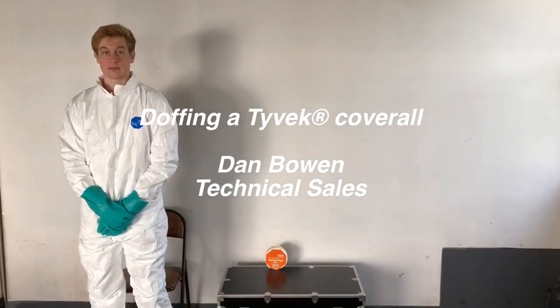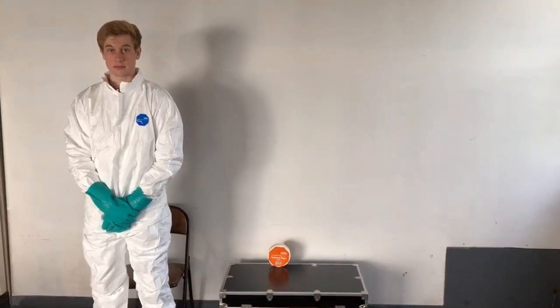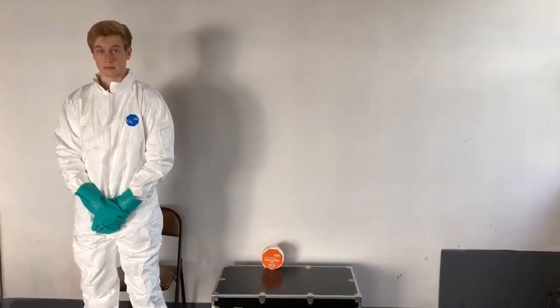Hello, this is Dan with DuPont Personal Protection. In this video we're going to review the doffing procedures for a Tyvek coverall. This is the procedure that a person would use if they're going to be doing self-doffing. Remember, doffing is really nothing more than another name for taking the garment off.